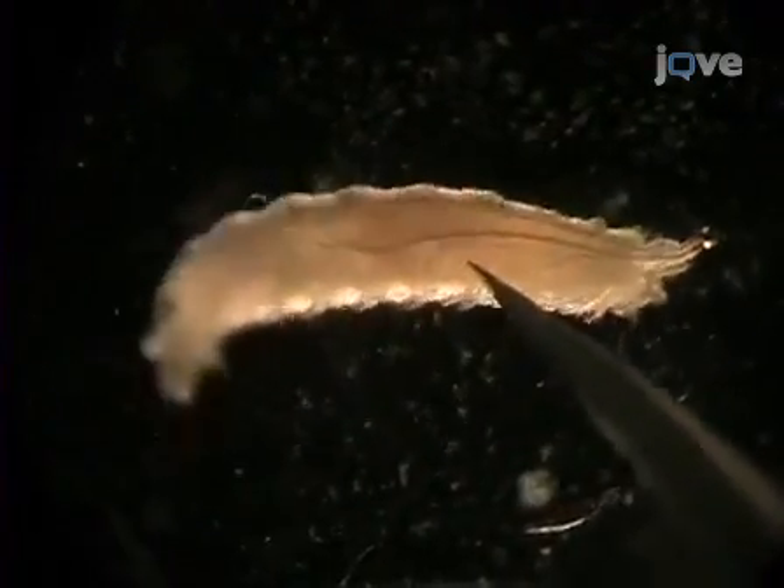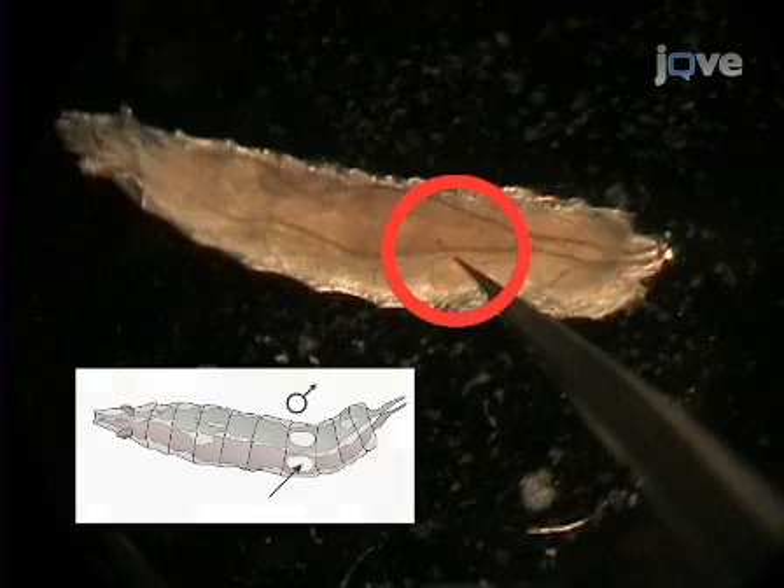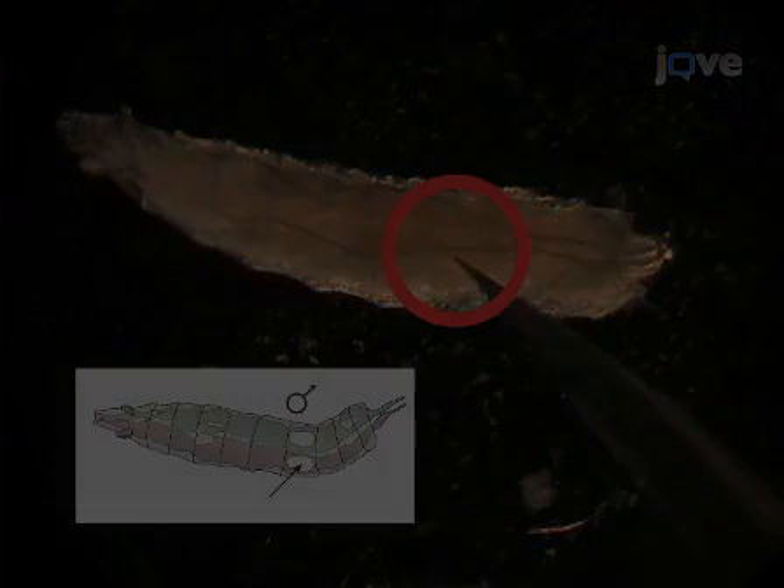Female larvae can be distinguished from males by their gonads. Male testes are easily identified as big clear ovals embedded in the posterior.